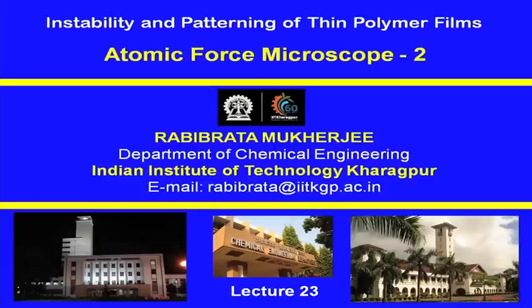Welcome back. We pick up our discussion again on atomic force microscopy, which we introduced in our previous session. We have just talked about the basic features of the atomic force microscope and introduced you to the concept of intermolecular or interatomic forces, primarily the van der Waals forces, which are responsible for imaging using an AFM. We also talked about the predecessor to the atomic force microscope, the scanning tunneling microscope, or the STM as it is known.